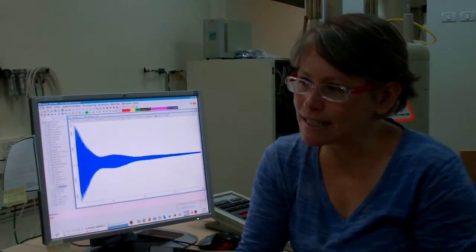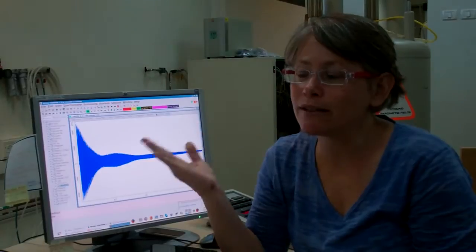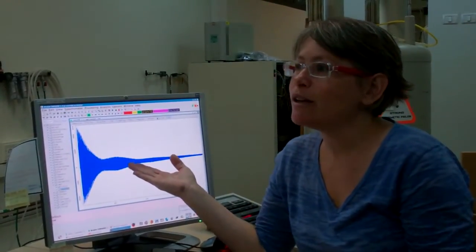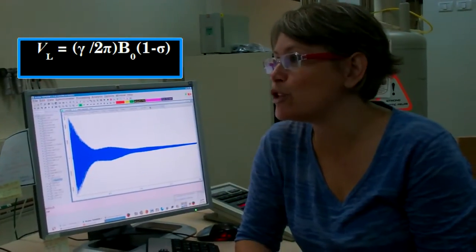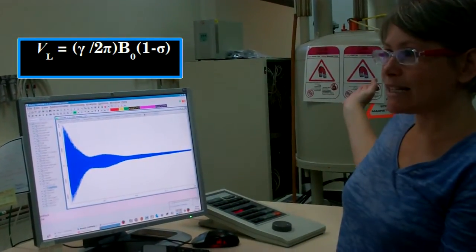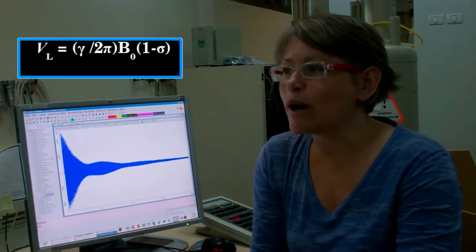Since we expect, based on the label on the NMR tube of this sample, that the clear liquid inside the tube is a mixture of deuterated and protonated chloroform, CDCl3 and CHCl3 respectively, there should only be one proton signal. Its resonance or Larmor frequency corresponds to the effective magnetic field felt by the nucleus. The effective magnetic field is a combination of the static external homogeneous magnetic field of 4.7 Tesla and shielding from the magnetic component of the electron density around the chloroform hydrogen nucleus. So here we should have one frequency that decays exponentially.